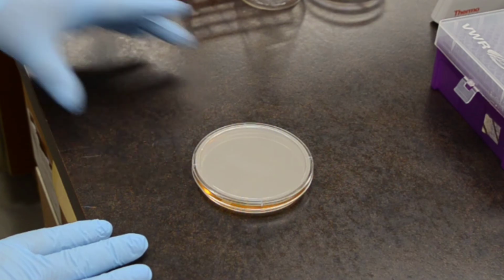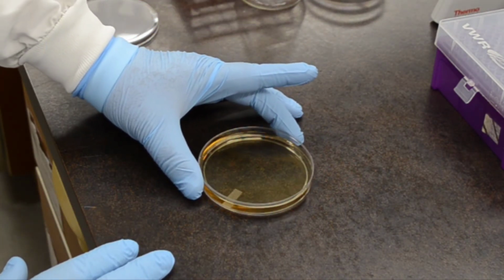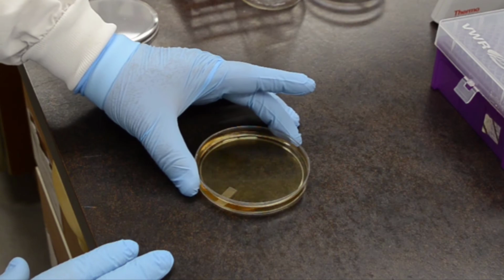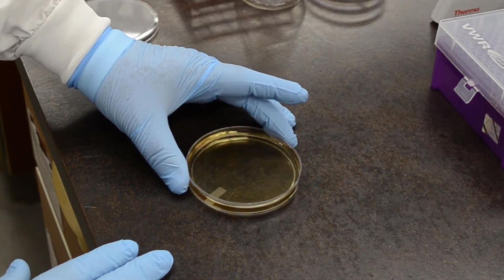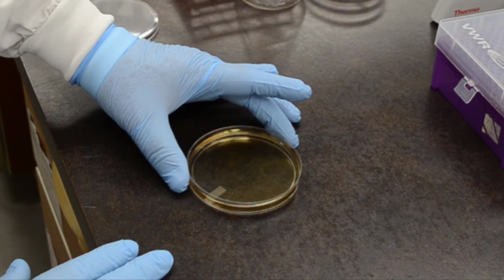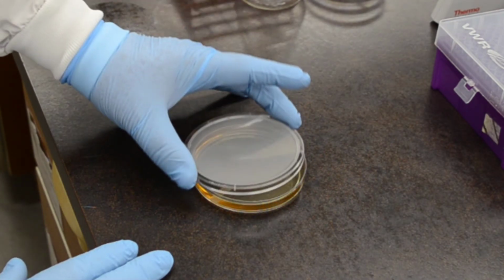Here, I will remove the lid so that you can see the desired level of swirling. You want to swirl the mixture enough so that you create a visible wavefront of liquid, as seen here, but not so strongly that it splashes up and over the rim of the plate. If that happens, the plate cannot be used and should be discarded because you cannot be sure it is not contaminated with any other organisms accidentally introduced into the mix.